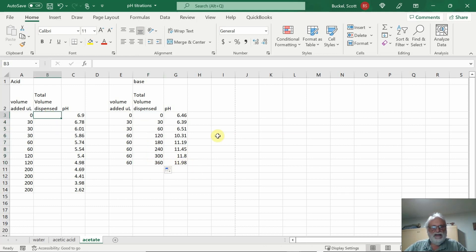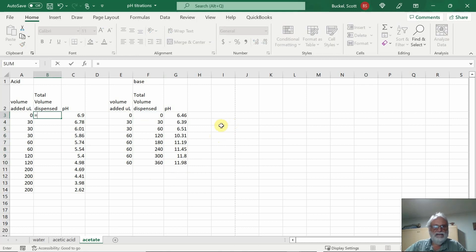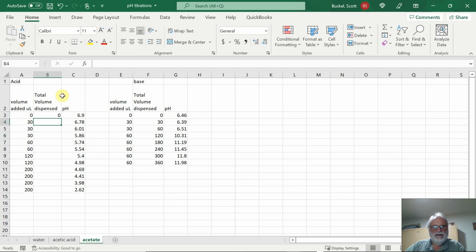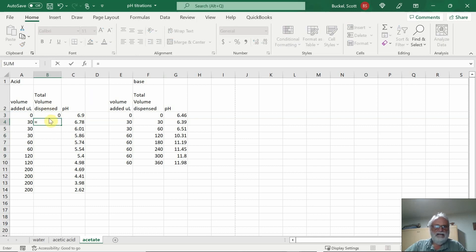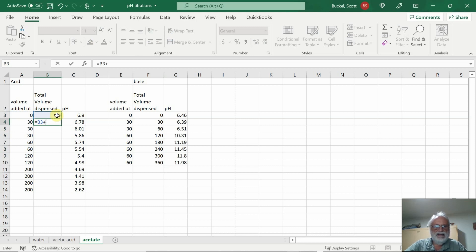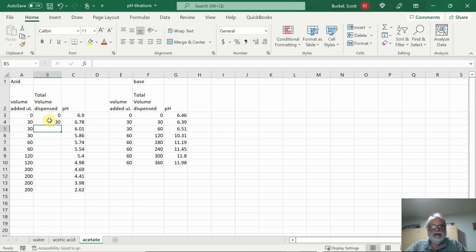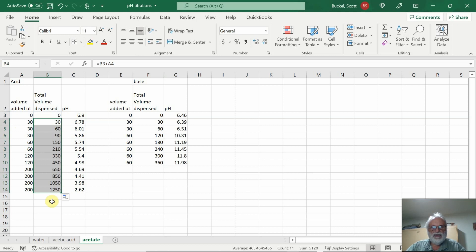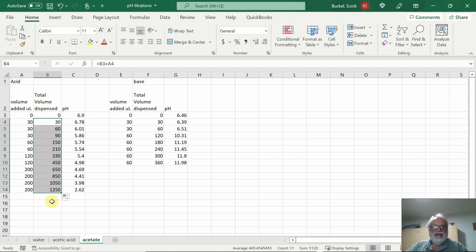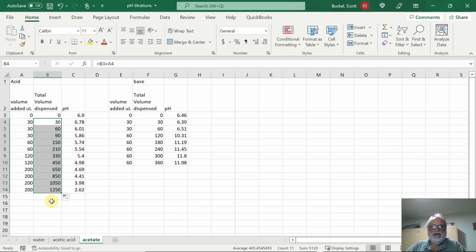So there was about 360 microliters total added to this solution to get to the pH of about 12. We'll go over here and do the same thing again. Hit equals, then hit that cell, hit enter, and you get a zero. Click the cell above it, hit plus, and that cell right there, and hit enter. This way you can copy on down, and this way you get all the numbers calculated for you, and you don't have to worry about them. You save, it's maybe a one-third savings.